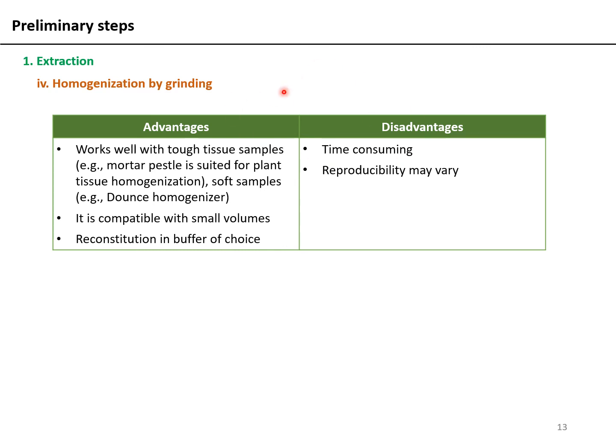Disadvantages are that it is time consuming and reproducibility may vary because it is dependent on how you're grinding it. It is completely dependent on the user who is performing it, because you're not really using any machine for it. So therefore the reproducibility may vary.